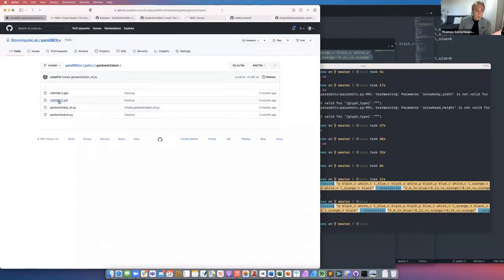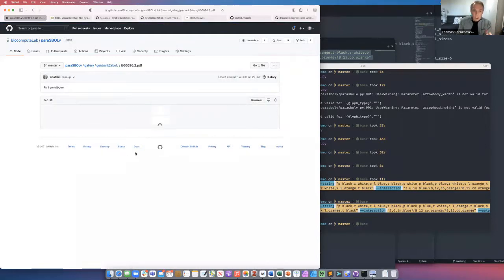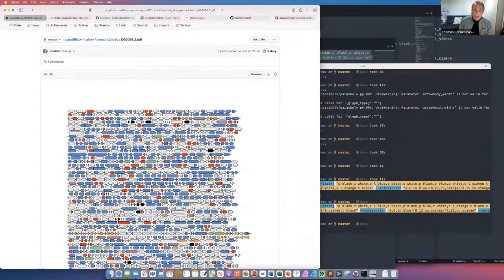And so when we run that on a genome, we're able to show the genome with these little elements colored depending on the function of that particular part from the genome. Obviously, the GenBank file encodes a lot more information that you could parse and represent in different ways, but that's really up to you in terms of how you'd want to do that.